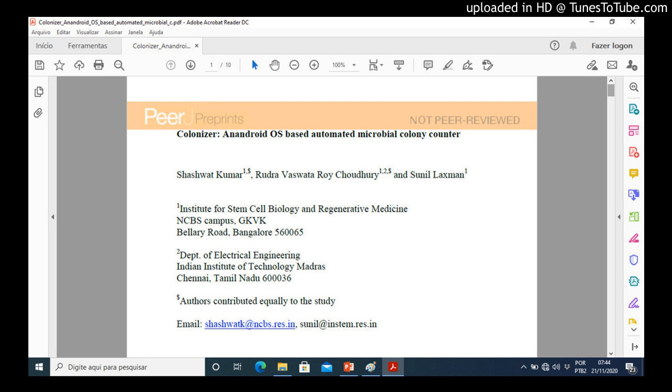This step is necessary to segment connected contours into individual components. By finding the regional maxima of the distance transform, the centers of the colonies can be estimated. Thus, the count gives the number of colonies. These processes are illustrated in Figures 3 and 4.